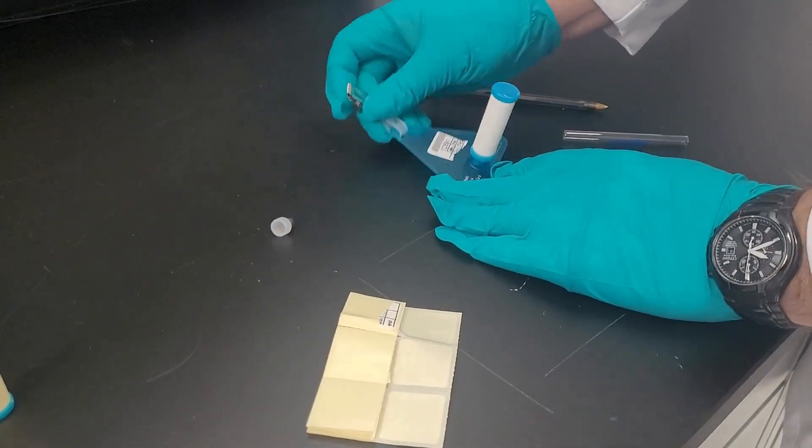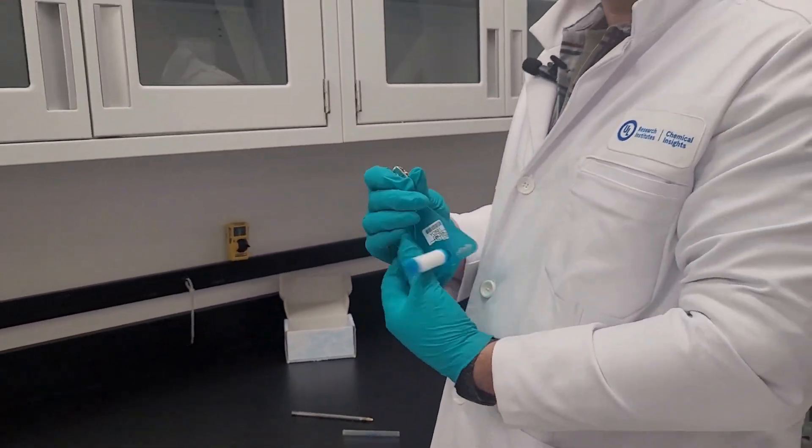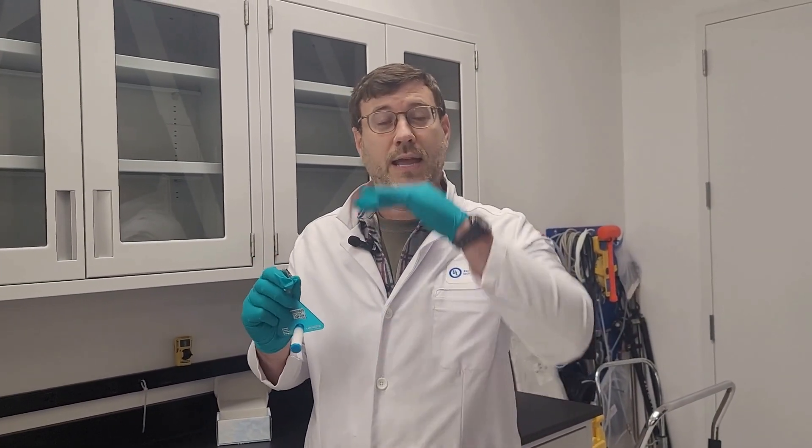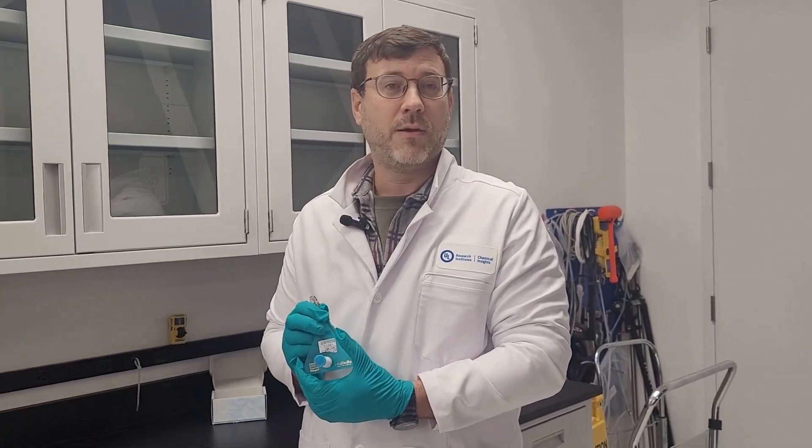And we are then going to take our passive sampler and hang it at a breathing zone height of somewhere in between five and five and a half feet to represent what you would be exposed to in the event that you were in the environment.